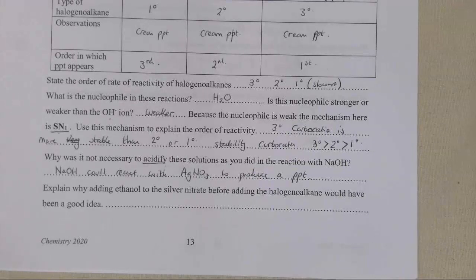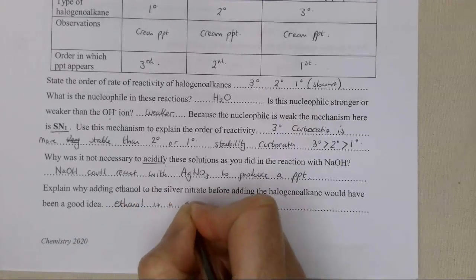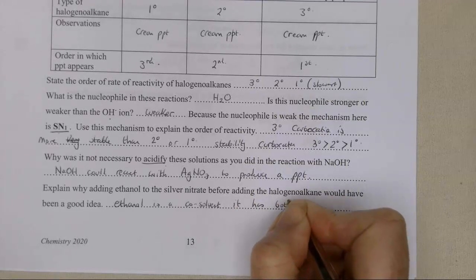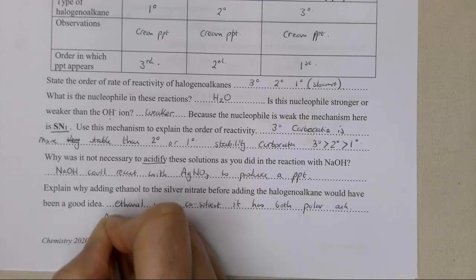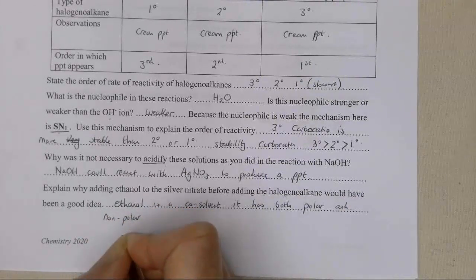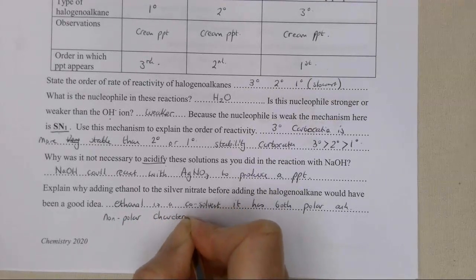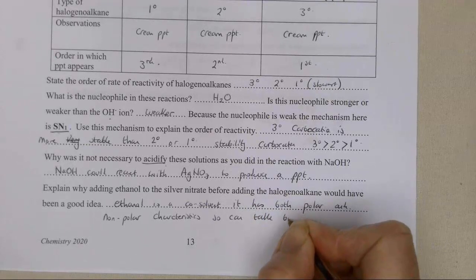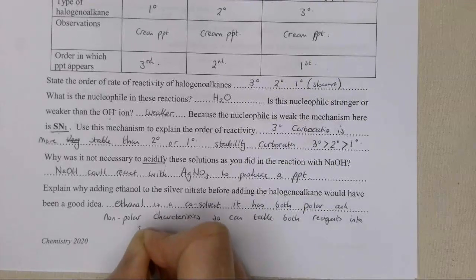Adding a little bit of ethanol to this before adding the halogenoalkane is usually a good idea. Why is this? Because ethanol, we've said this before, is a co-solvent. It has both polar characteristics, in other words it can form hydrogen bonds, and non-polar characteristics, because it has a CH3CH2 group, so it can take both reagents into solution.